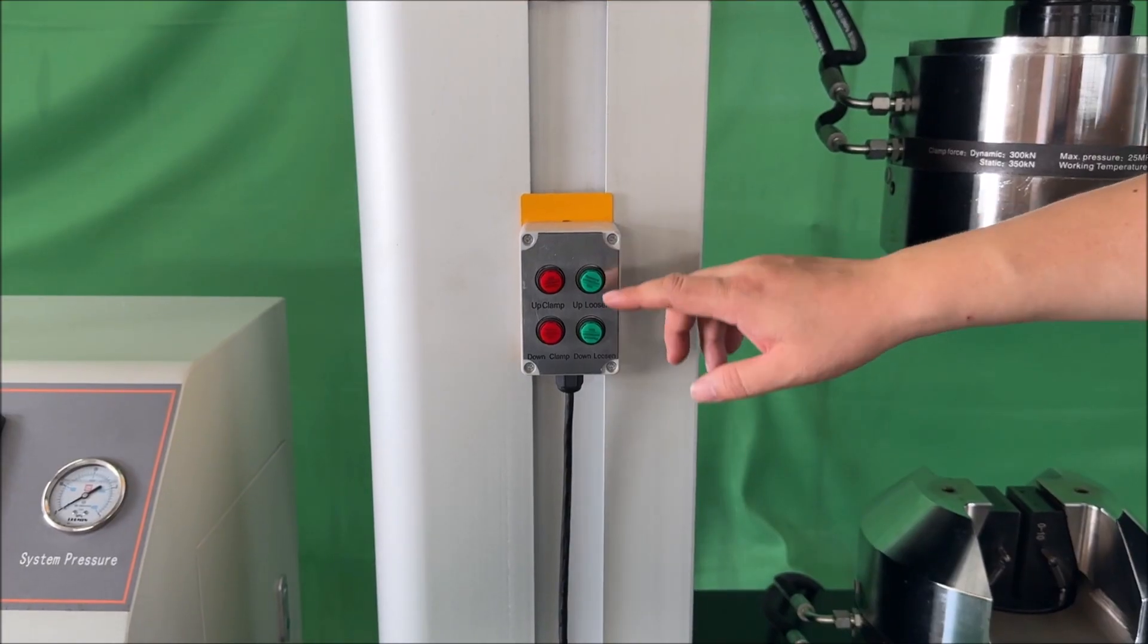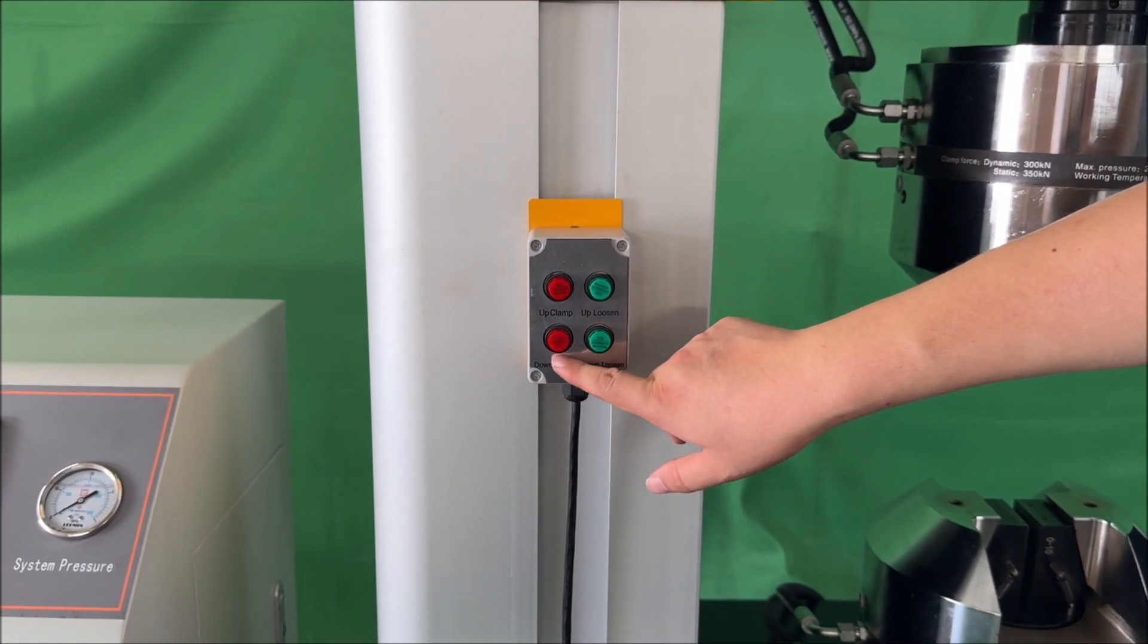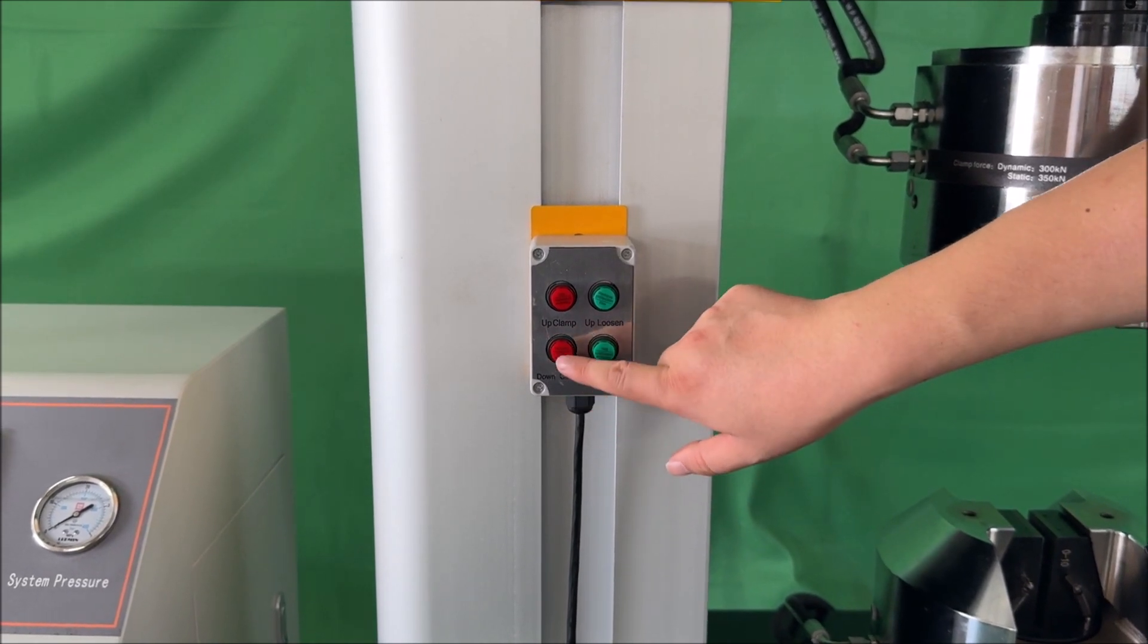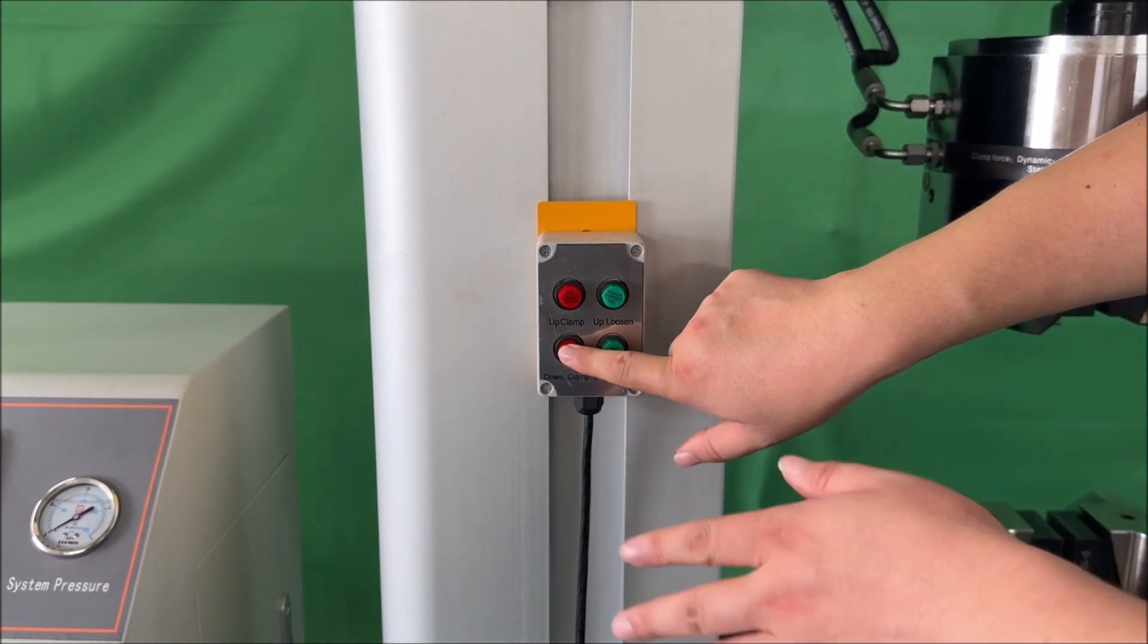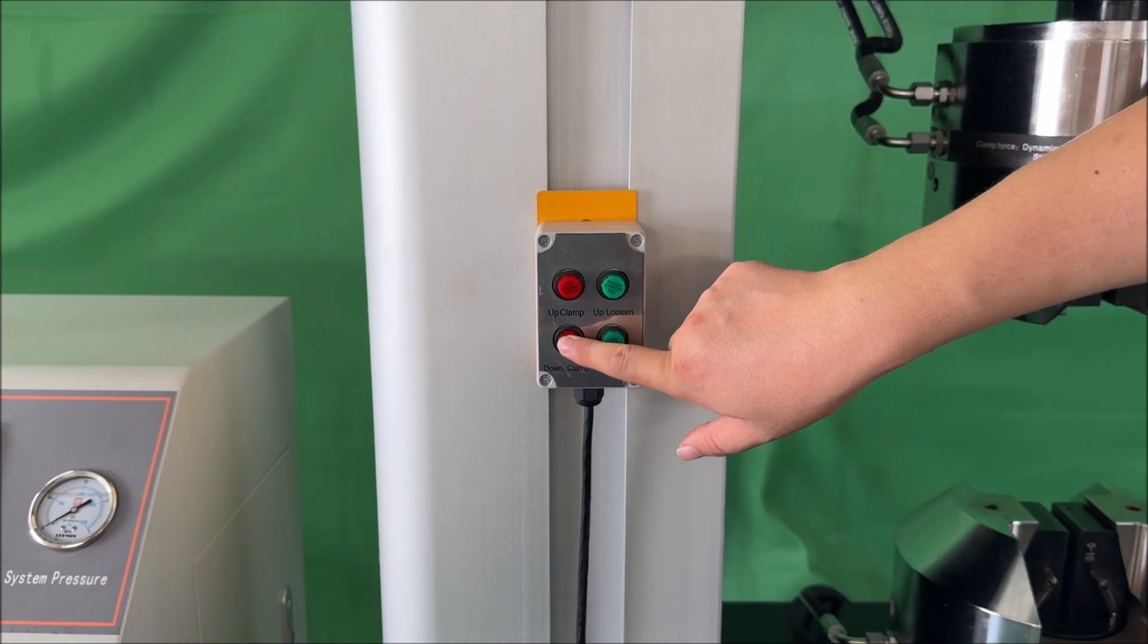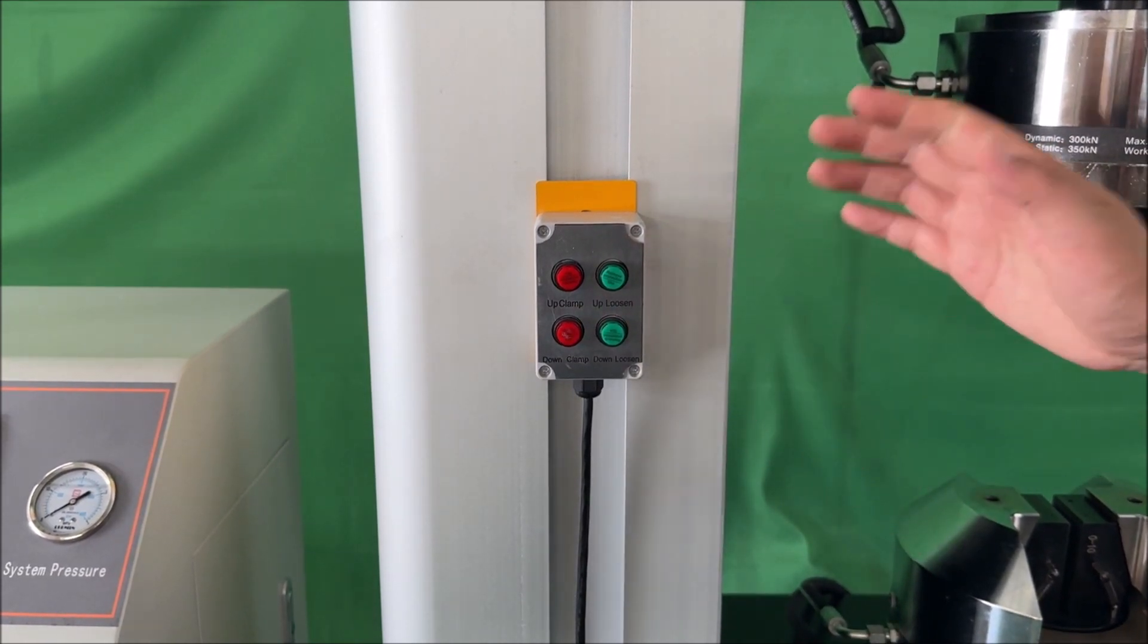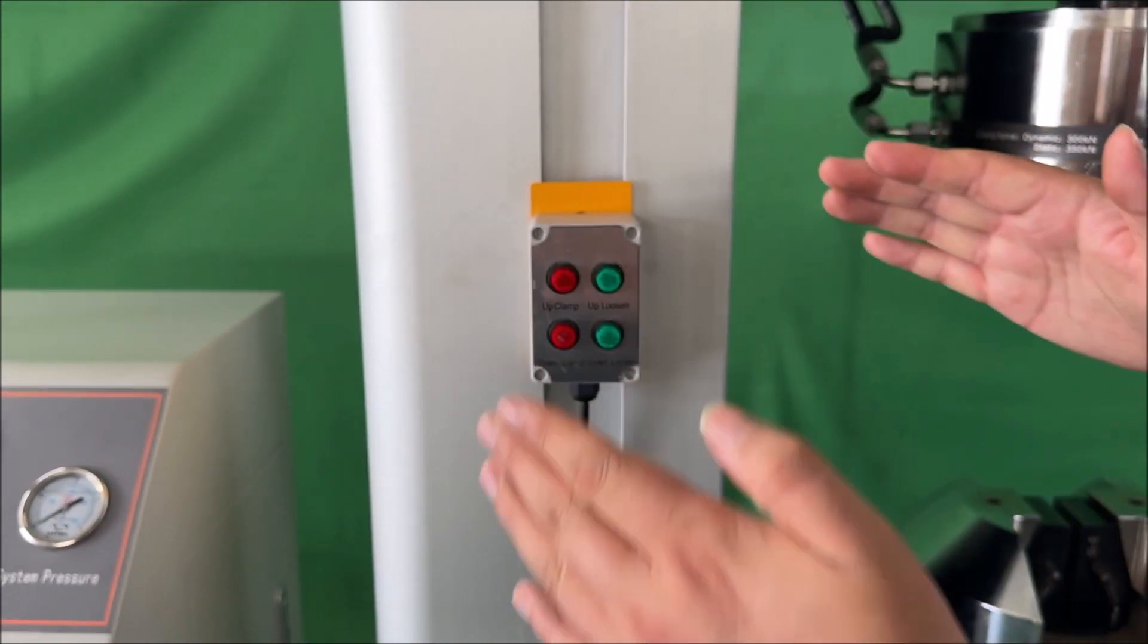The same procedure applies to the lower operation. Hold the button until the pressure reaches 2 megapascals. Once this level is reached, you can release the button, and the system will continue to attain the target clamping pressure.